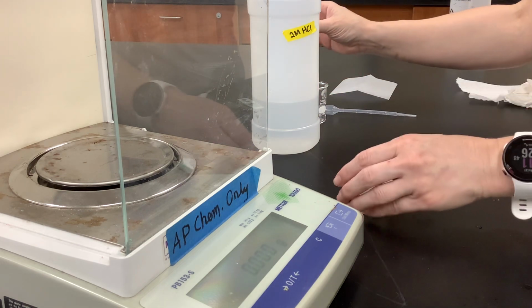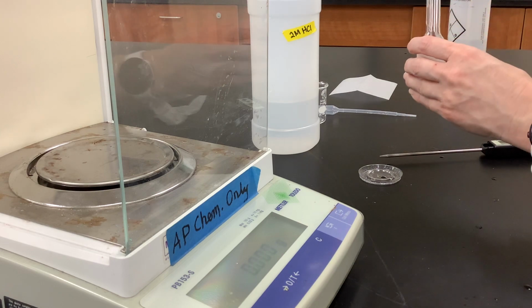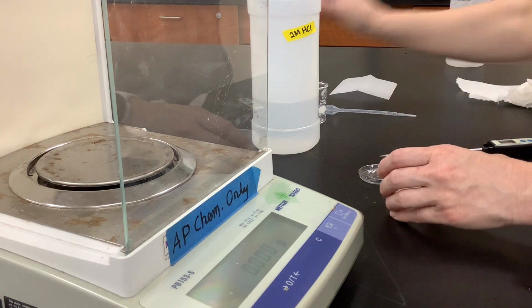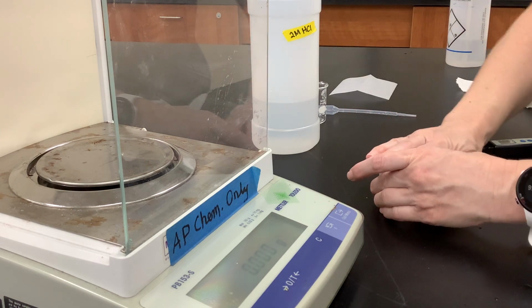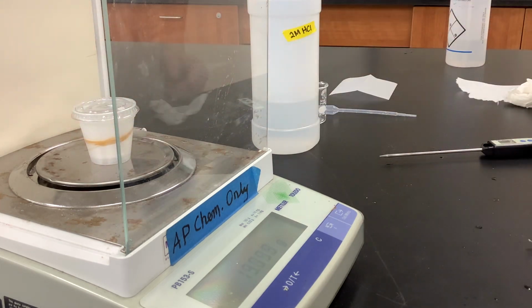Okay, and we're going to add that to our calorimeter. Our lid on. Okay, take our mass. Okay, 12.921.